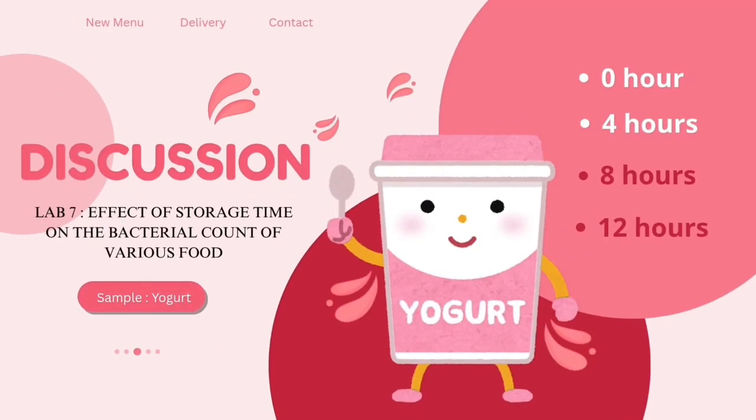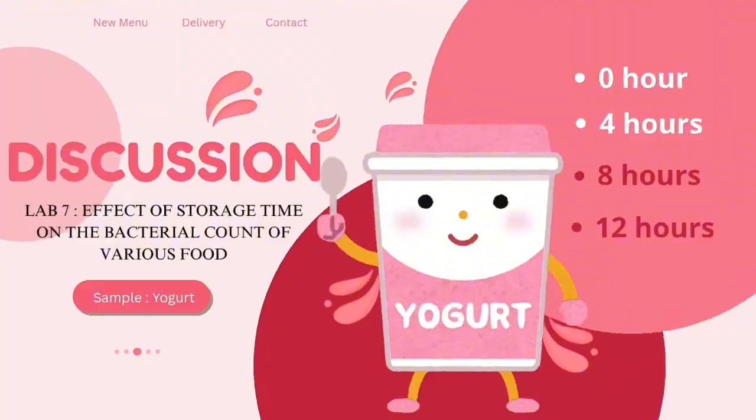Moving on to the next part, in this practical, we investigated the effect of storage duration on the bacterial count of yogurt. The yogurt samples were left for 8 hours and 12 hours before microbial analysis was carried out. Serial dilutions of 10^-3, 10^-4, and 10^-5 were prepared and plated on plate count agar to observe bacterial growth.